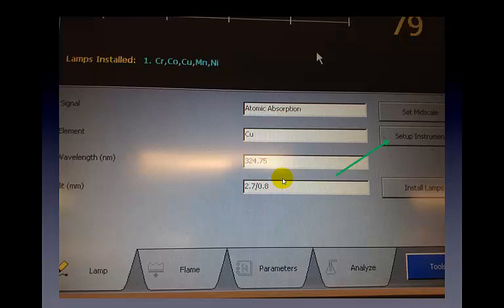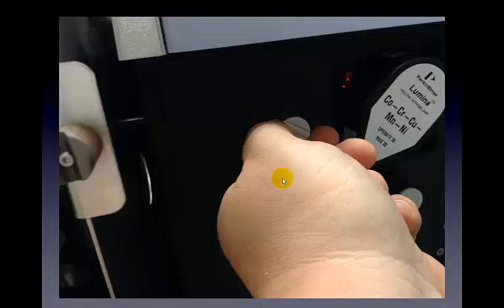Once you press the Setup button, you will hear a lot of buzzing and whirring inside the instrument as it goes through all of its self-checks and gets set up. Now is a good time to look at the lamp itself — if you look very carefully, you can see a pinkish glow coming from between the lamp and the body of the instrument, indicating the lamp is receiving power and producing light.